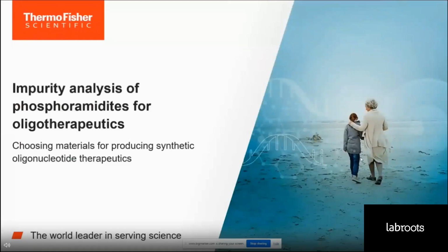My goal is to help give you insight into considerations you should have when choosing starting materials for your oligonucleotide therapeutic, and that specifically means the phosphoramidites that are used in the synthesis. My experience has been on the quality side of manufacturing and testing of phosphoramidites for over 18 years, and I currently work at the Thermo Fisher site in Milwaukee, Wisconsin, which we consider ourselves a center of excellence for nucleic acid chemistry within Thermo Fisher.